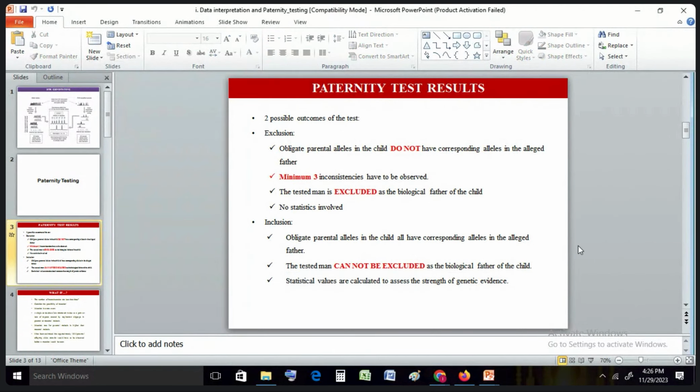So এখানে যে জিনিসটা বুঝতে হবে, you are not looking for the same person, you are looking for the parent or the children, whatever, paternity testing. You are looking for someone related. So you can absorb or tolerate some mismatches. And what is the tolerate level? At highest 2. দুইটা পর্যন্ত tolerate করতে পারবা. You can tolerate 2 mismatches. But if it is 3, you can confidently say that these 2 persons are not biologically related. They are not son or daughter, or mother or father of each other. Okay?